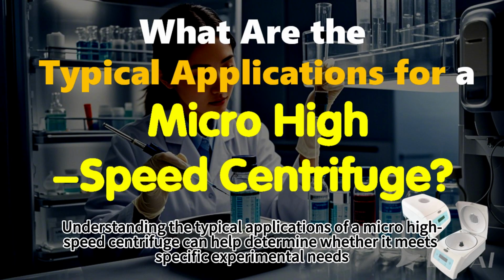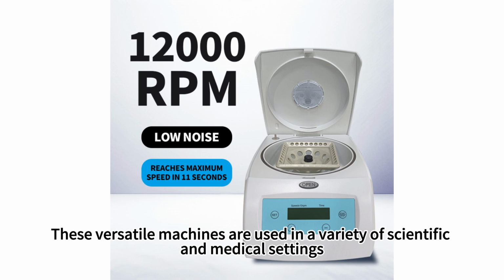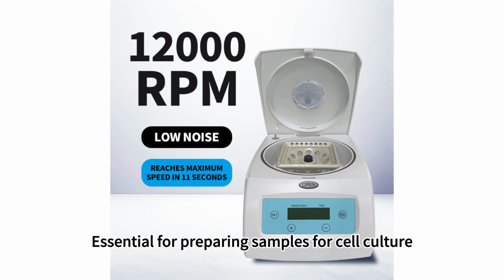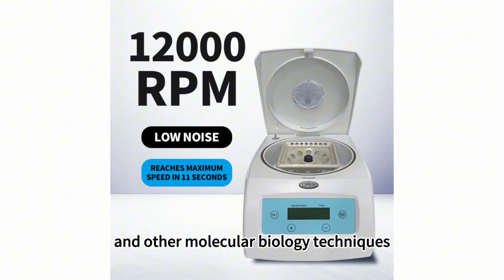Understanding the typical applications of a micro-high-speed centrifuge can help determine whether it meets specific experimental needs. These versatile machines are used in a variety of scientific and medical settings. Typical applications: cell separation. Description: used to separate cells from fluids or to pellet cells for further analysis. Importance: essential for preparing samples for cell culture, PCR, and other molecular biology techniques.